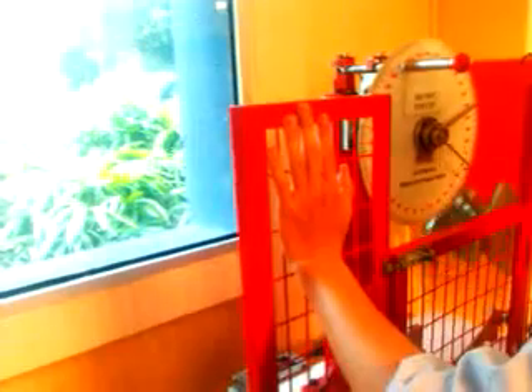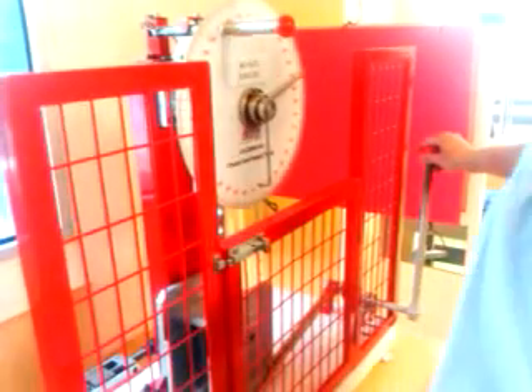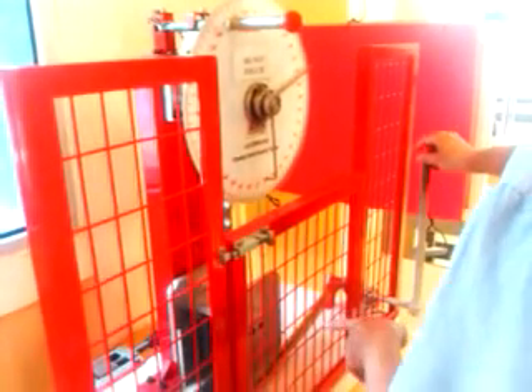Apply the brake slowly. When it gets very slow, apply the brake completely to stop the hammer. If you apply emergency brake and spoil the equipment, please pay $5,000.